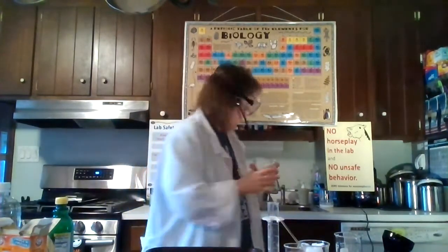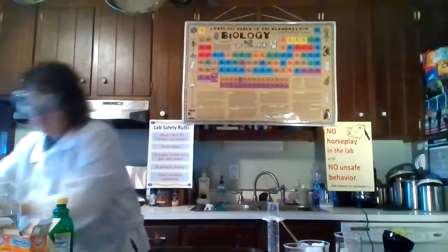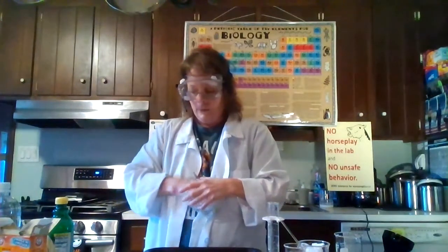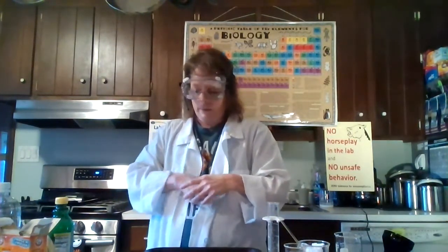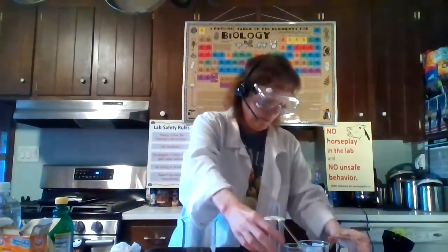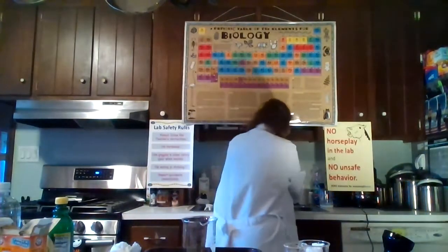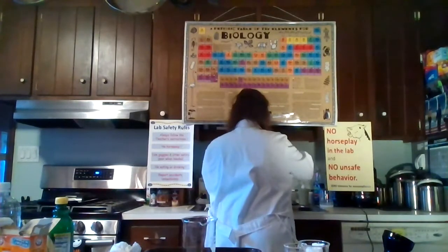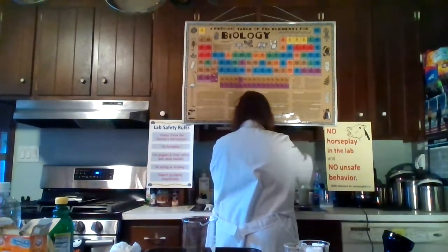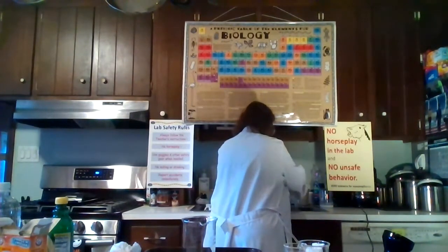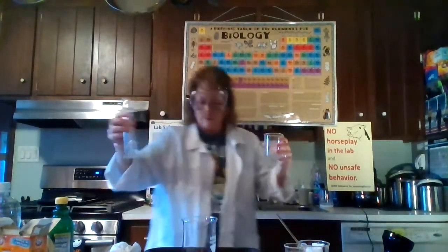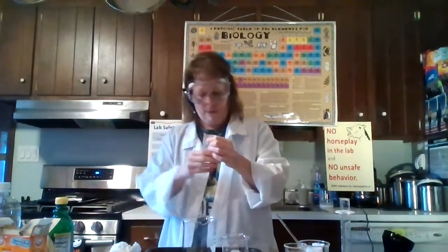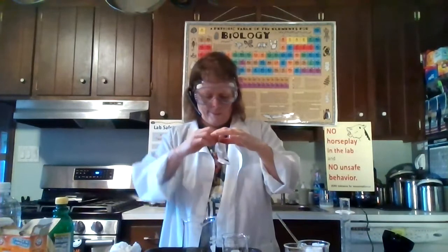It says that we're going to add one teaspoon of Kool-Aid powder to a jar — in this case, we're just using the beaker. Using the graduated cylinder, add 60 milliliters of water. Since this is only a 50-milliliter graduated cylinder, I'm going to have to add water to it twice. So that's 50 — I need to add another 10 — that makes about 60 milliliters of water. We need one teaspoon of Kool-Aid. I found some old Kool-Aid in the back of my cabinet.